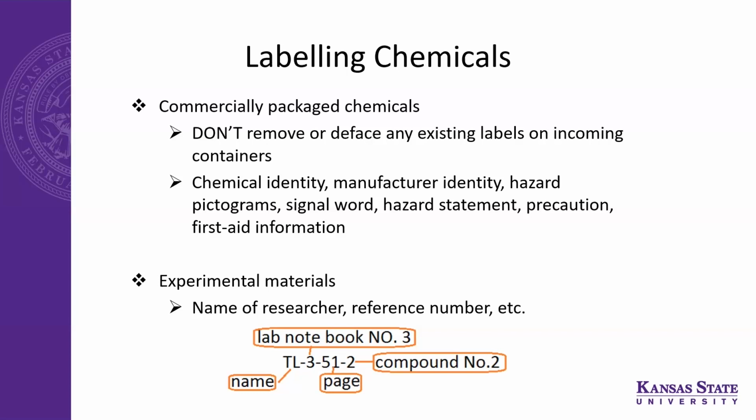So people make NaCl solution, any sodium chloride solution. On that solution also, yes, because it's colorless, right? It can be anything. It can be water. It can be concentrated acid, because all the acids are colorless. So regardless of the chemical, even if it's water, because you might be working and you may leave for lunch, right? And there can be an accident while you are gone.